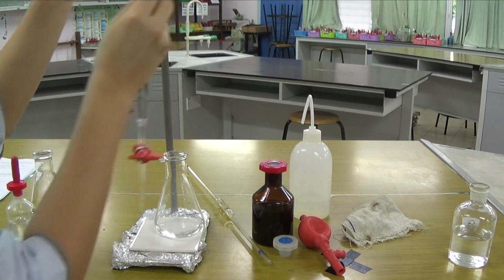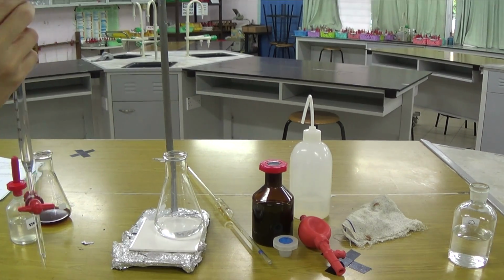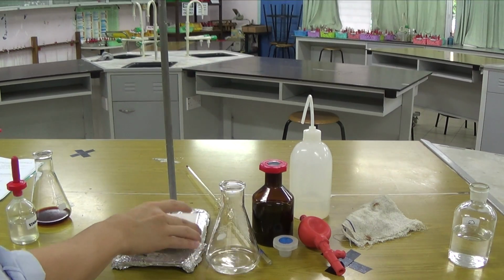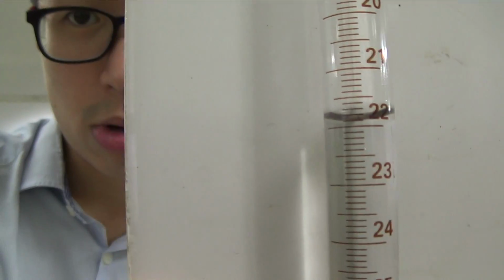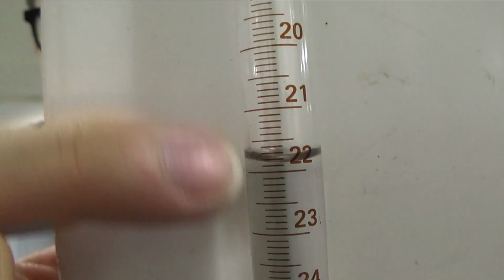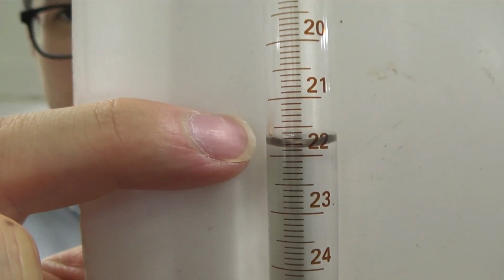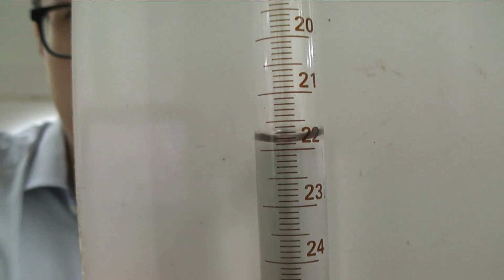This one is 21.9 cm cubed. If I just bring my white tile here, 21.9 cm cubed. Hopefully you can see that better. Let me just move that out a little bit. So 21.9 cm cubed. So reading below the meniscus, 21.9 cm cubed. So you've got 21, 22, so you're reading downwards. So 21.1, 2, 3, and so on. Middle point is 21.5. So you've got 21.9 below the meniscus there.